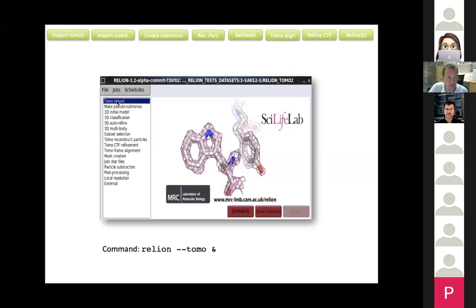I think Kino and Jacinko have mostly used IMOD, and they've written import code to import from the directory structures of IMOD into the RELION framework. And I've seen on Twitter that other people have been working on doing this for other software as well. I think I've seen something for M come around in the past few weeks.